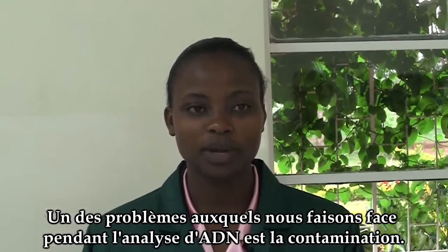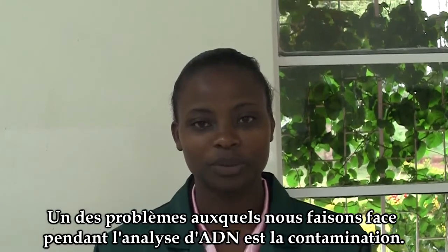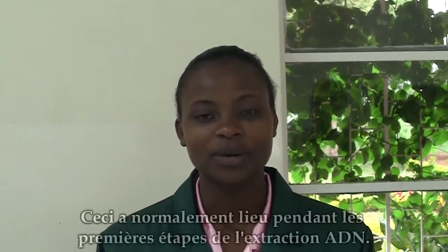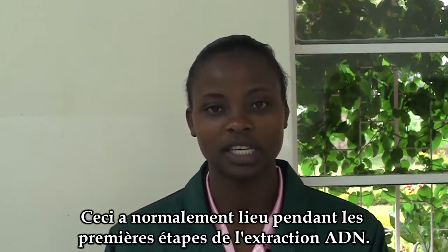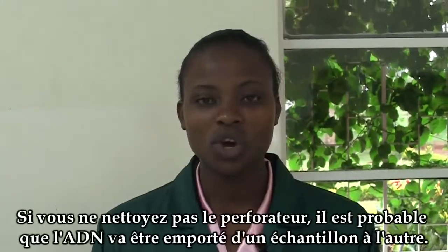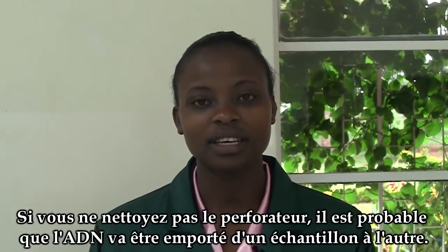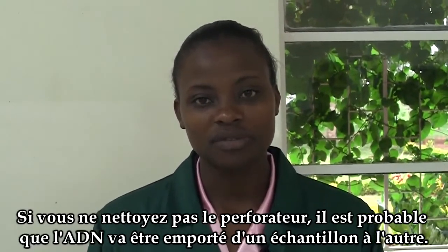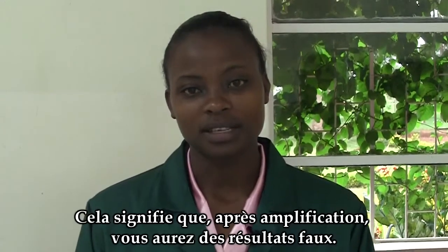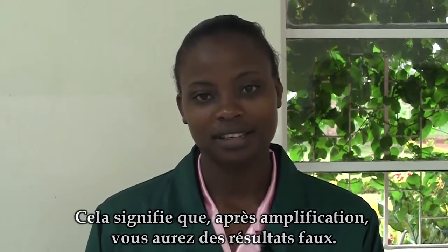One of the problems that we face during DNA analysis is contamination. Contamination usually takes place at the early stages of DNA extraction. If you don't clean the punching device that you have, you are likely to carry over DNA from one sample to another. And what will be the result after amplification? You will have false results.